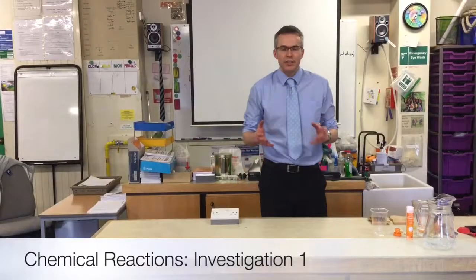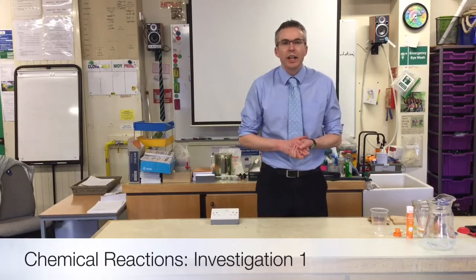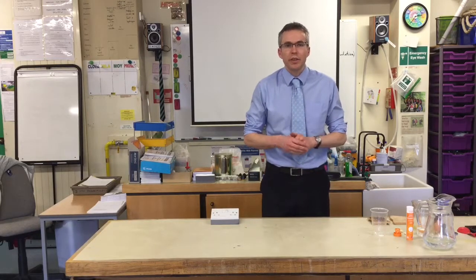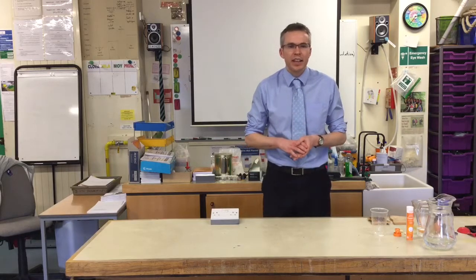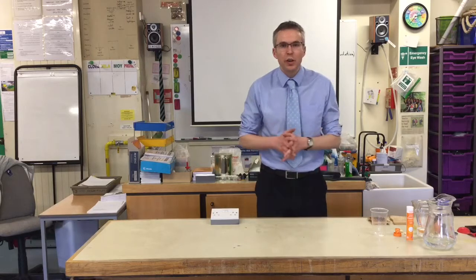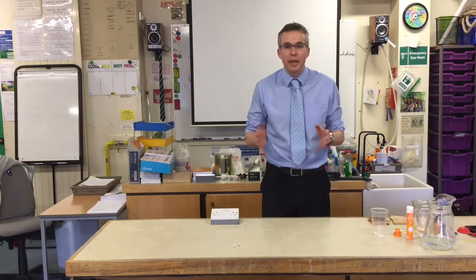Okay, we're going to look at a series of experiments now to demonstrate some chemical reactions so that the pupils can identify a chemical reaction but also look at the signs of a chemical reaction, so the kind of things they can see, hear or perhaps smell to tell them that the chemicals are changing and it's a chemical reaction.